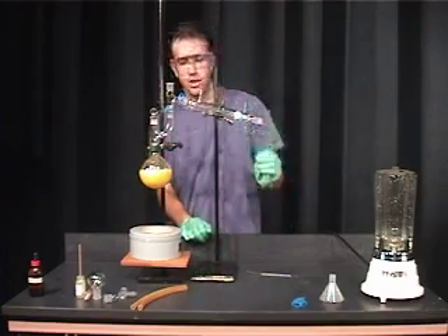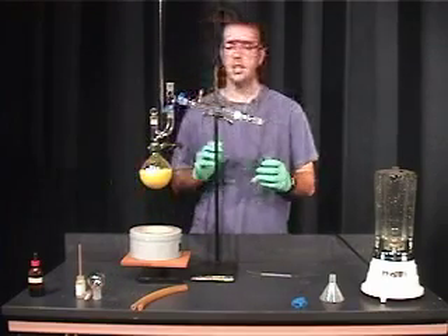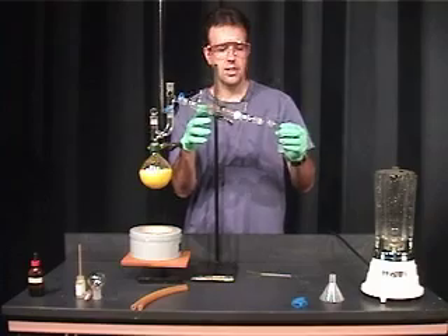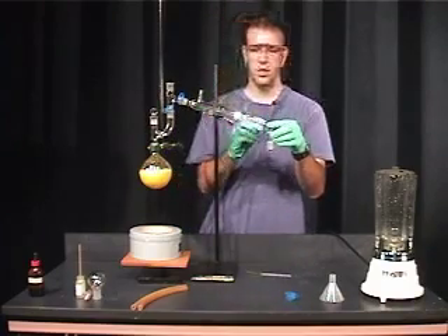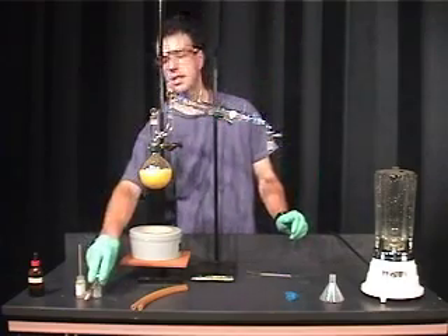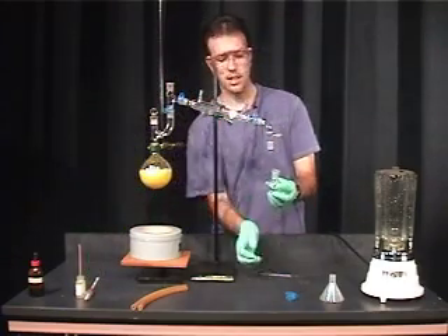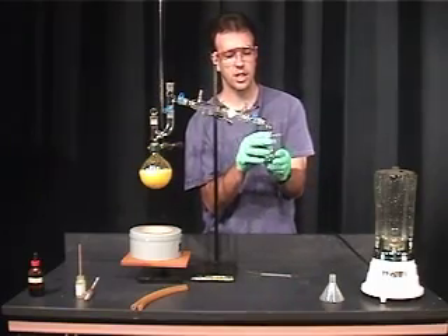Now that we've gotten to this point, we can add our vacuum adapter. The solution has condensed by the time it reaches the vacuum adapter, so no grease is needed at this point. Secure this joint using a Keck clip, and finally add in your 50mm round bottom flask. Also secure this using a joint clip.